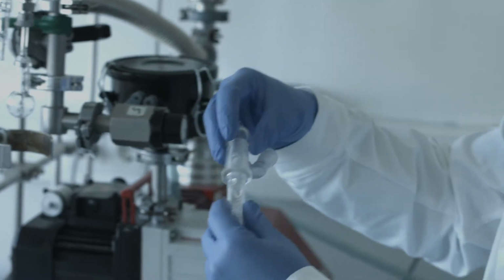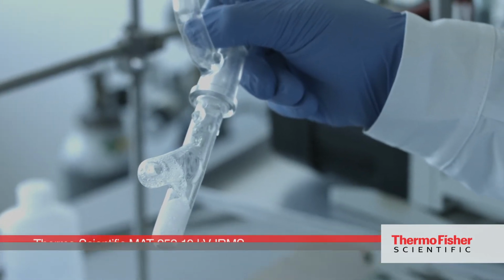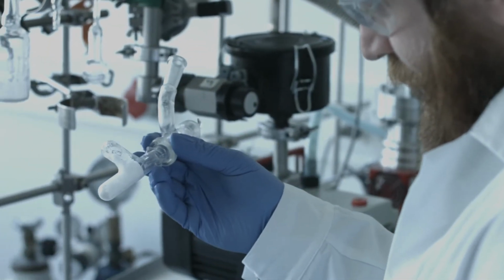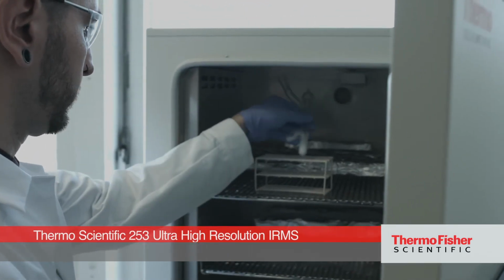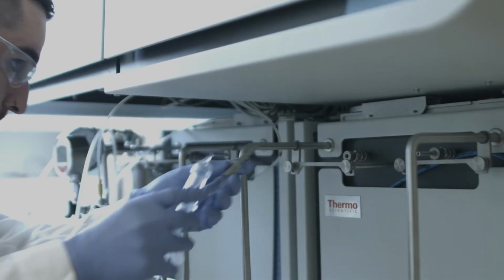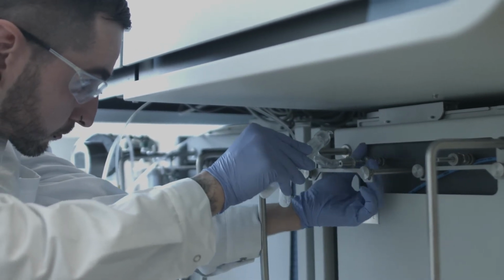Well, with a conventional MAT 253 mass spectrometer, this is the machine that we use for high precision measurements of the 3 oxygen isotopes on O2 that we extract from the different materials. We use a high resolution gas source mass spectrometer, the 253 Ultra, for triple isotope measurements on CO2, by direct measurements of the triple isotopes on CO2 without any further preparation of the samples.